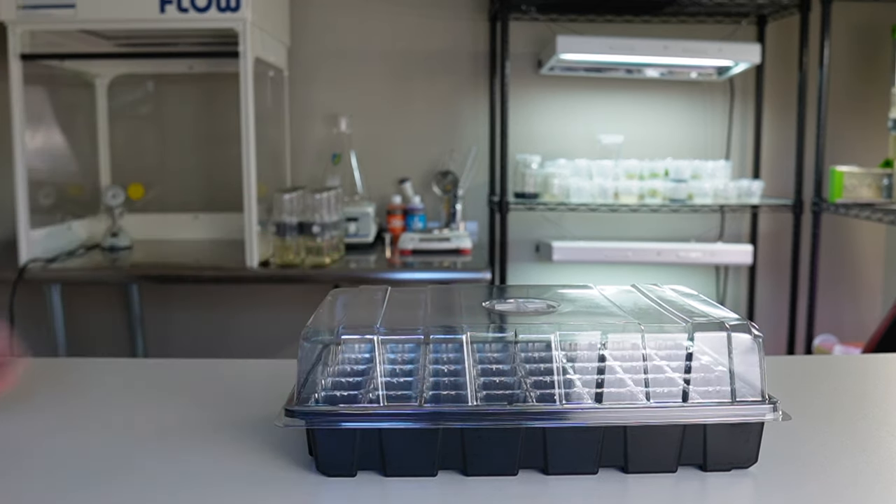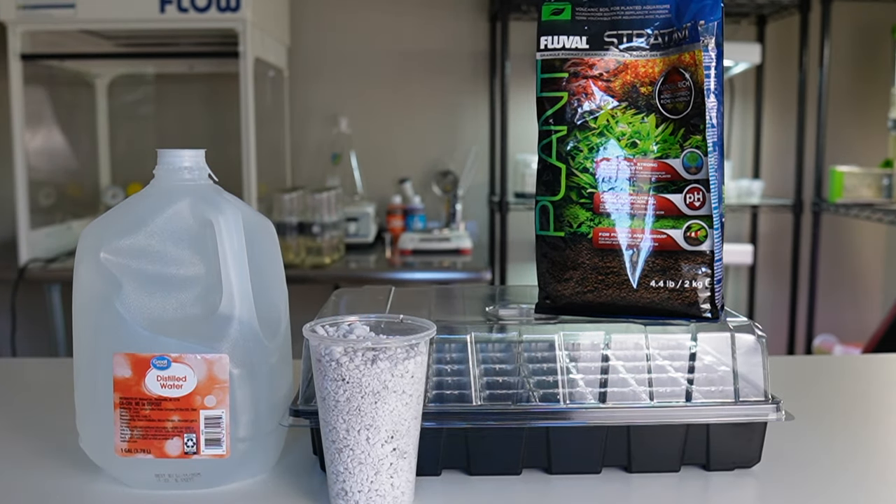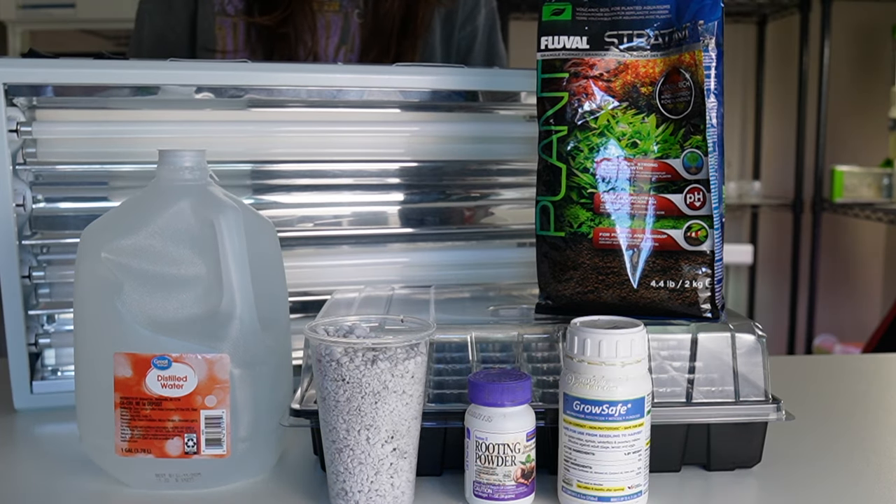To acclimate these plants, we are going to need a tray with a clear plastic lid, perlite, fluval stratum, distilled water, rooting hormone, fungicide, LED lights, and of course, some plants. Everything that I use in this video is going to be linked below.